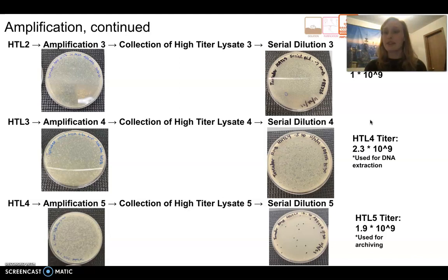We tried a lot of different things to try to overcome it, but ultimately we ran out of time, and our phage was being very stubborn, so that is the highest titer we could get, even though it's less than what we needed.